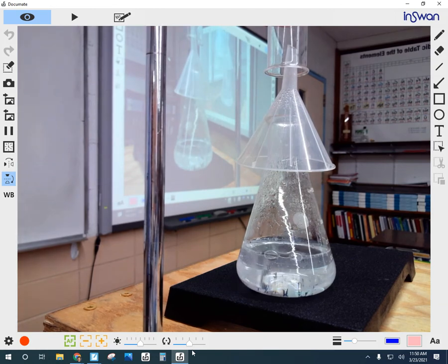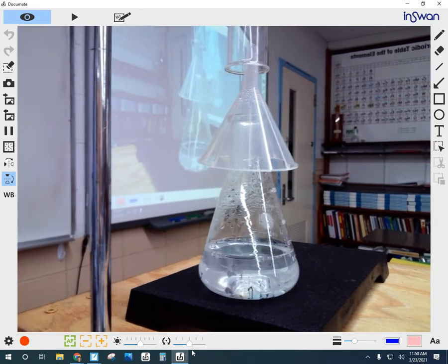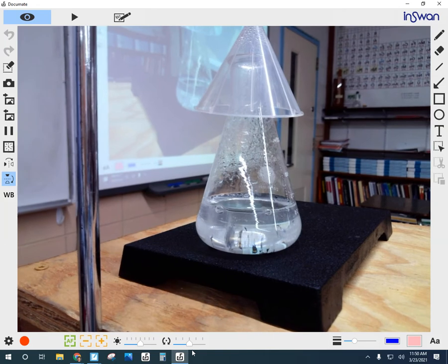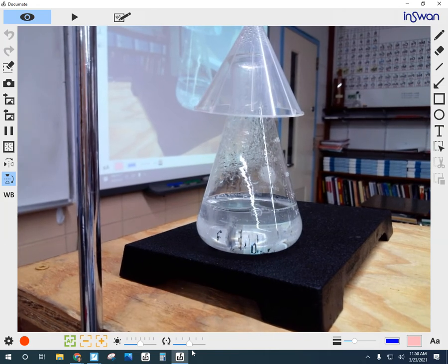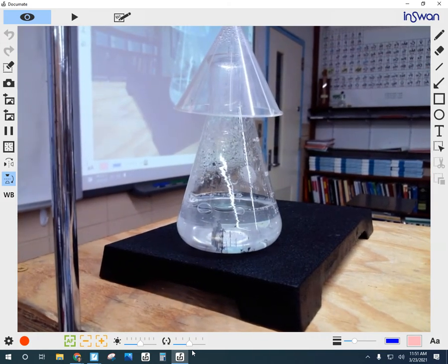So we can see it's still bubbling away there. The amount of zinc, I don't know how well you can see it, is quite a bit less because, again, the zinc is dissolving into zinc chloride. And when it's ionized, it is aqueous, right? It's soluble in the solution. I want to give that just a couple more seconds.